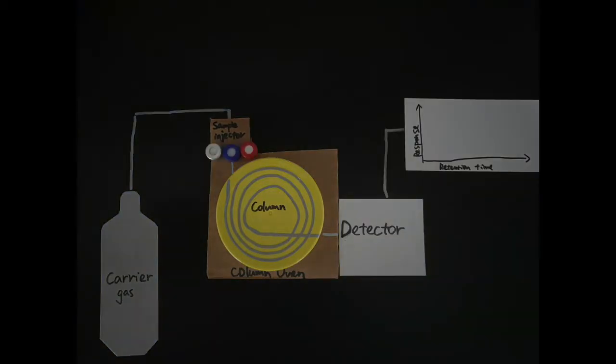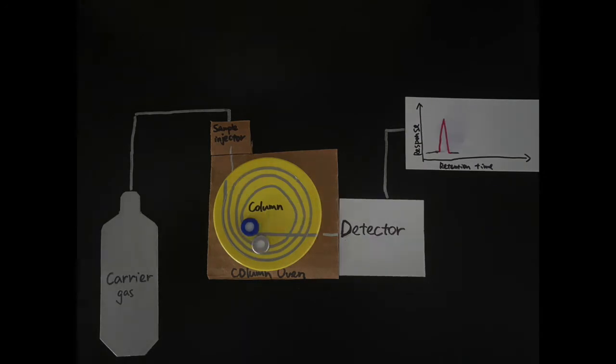After entering the column, different chemical constituents of a sample pass in the carrier phase at different rates depending on their various chemical and physical properties and their interaction with the column filling. Finally, they exit the end of the column at different times and enter the detector. In the detector, they are identified electronically, and the peaks of different compounds will be shown on the screen. Usually, the order of retention is mainly governed by boiling points.